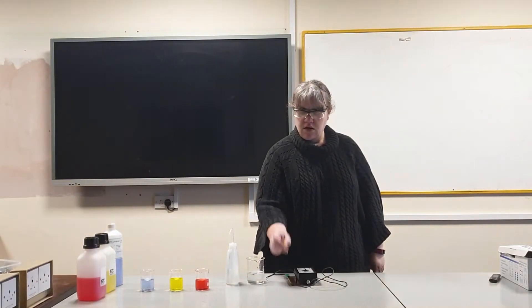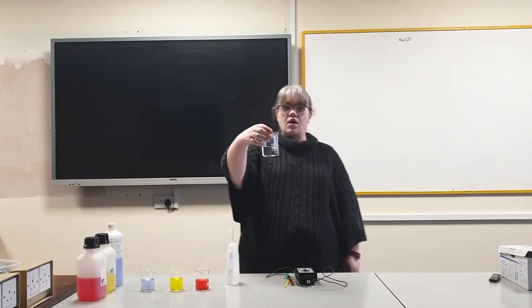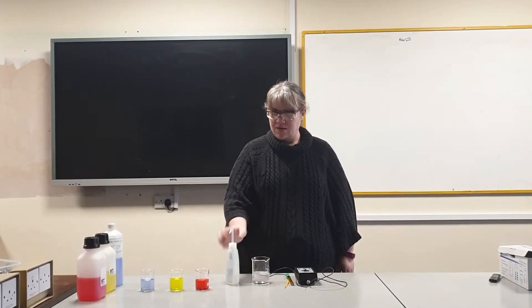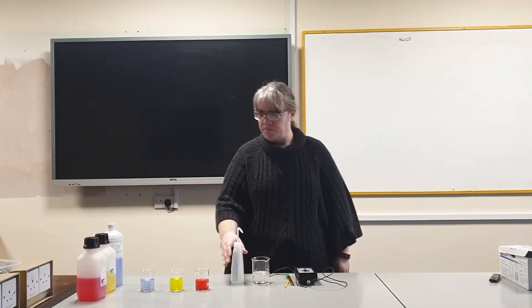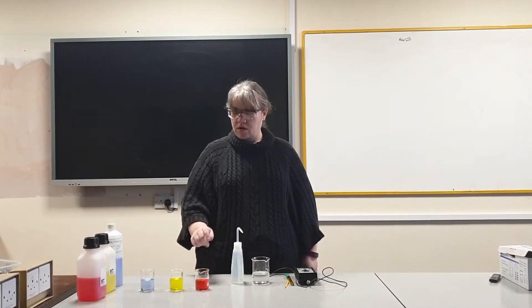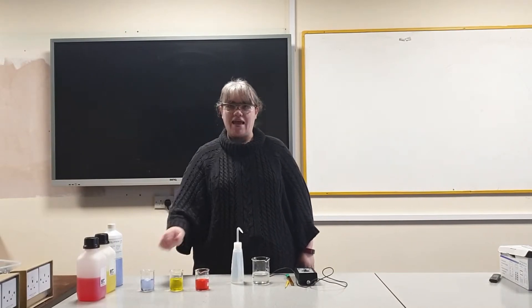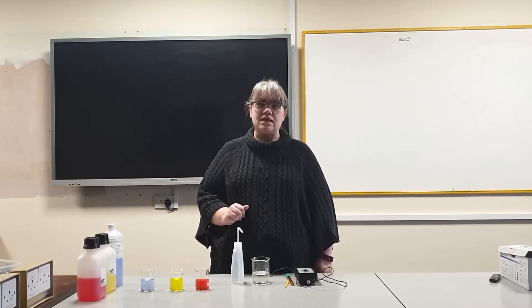Hello, today I'm going to show you how to calibrate a pH meter. You will need a pH meter, small screwdriver, a wash beaker, distilled water and your buffer solutions. I have a pH 4, pH 7 and a pH 10 and I've decanted a small amount into three separate beakers.